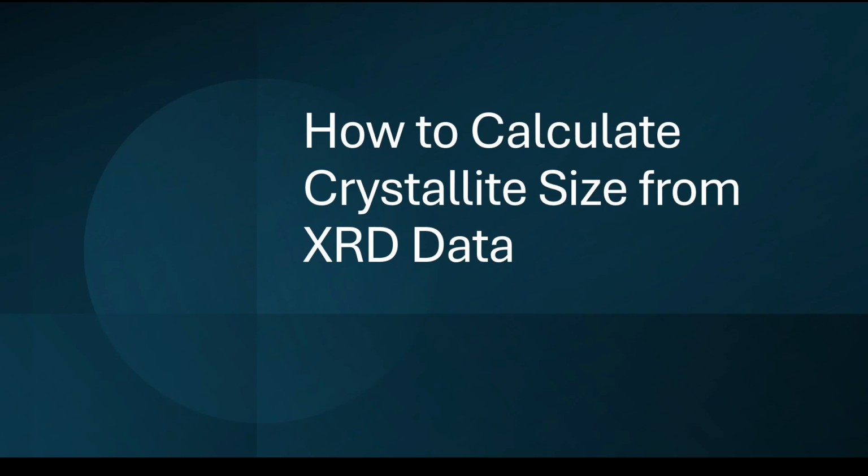In this video, I'm going to show you how to calculate crystallite size from XRD data.